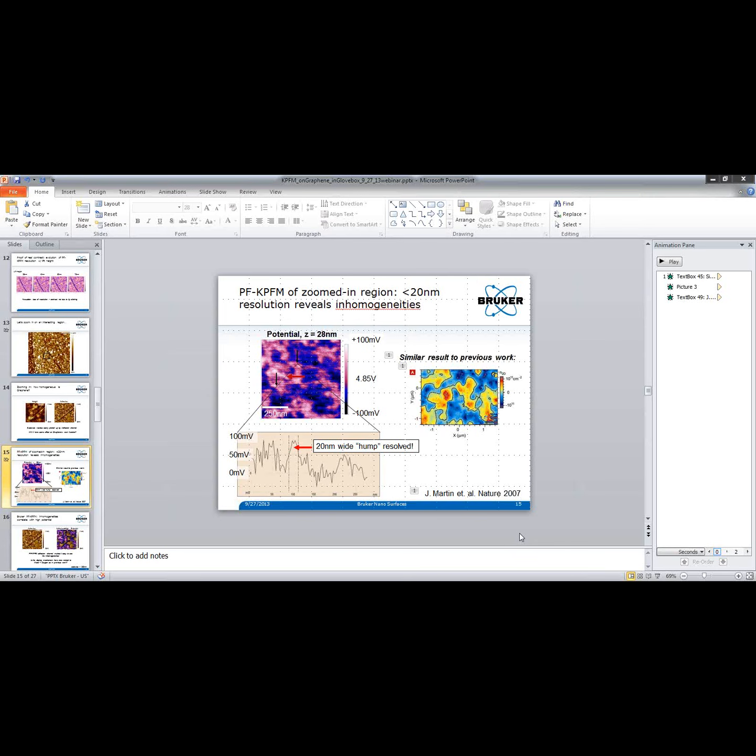It's difficult to do with tapping mode. With PeakForce tapping, it's pretty routine. I just type in the number and there's no problem. So yeah, it would be great to manipulate the puddles, but I don't know if force is the way to do it. You may have a very limited amount of things you can do, but you may start to deteriorate your image quality and you might lose the resolution that you need to see these puddles, unfortunately.